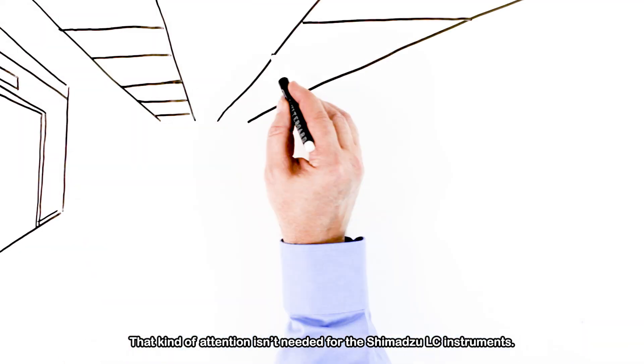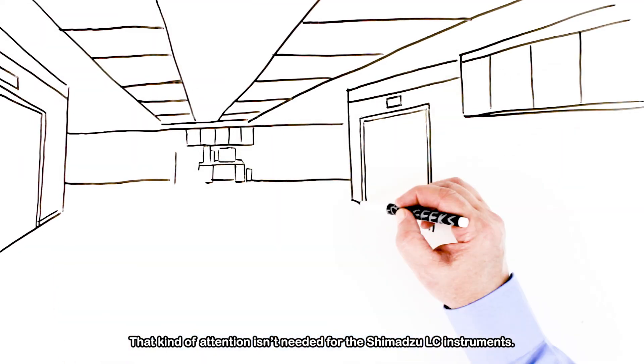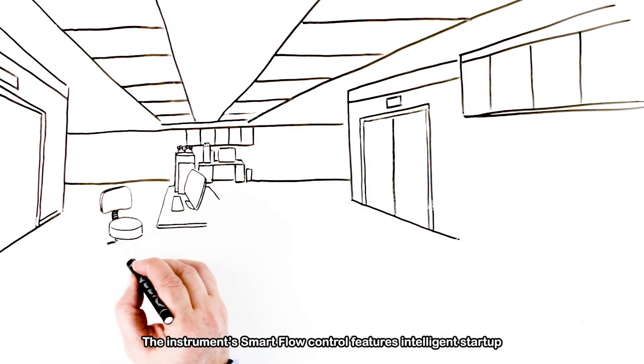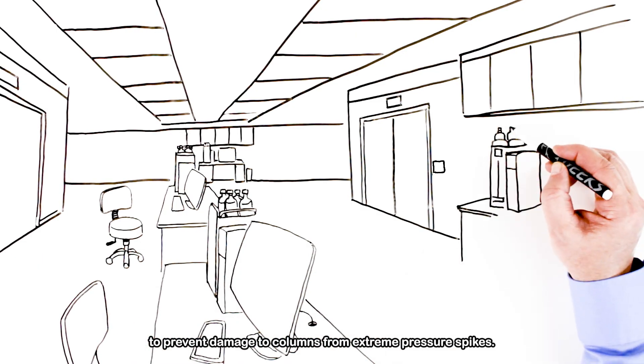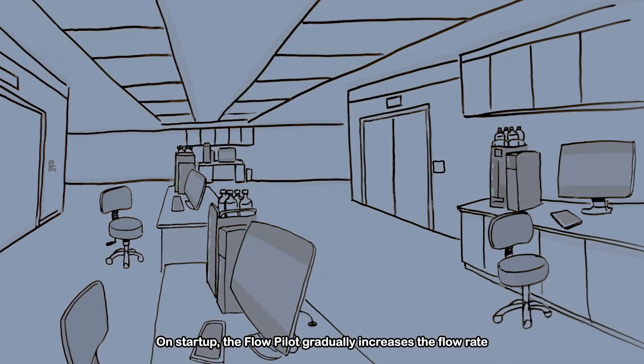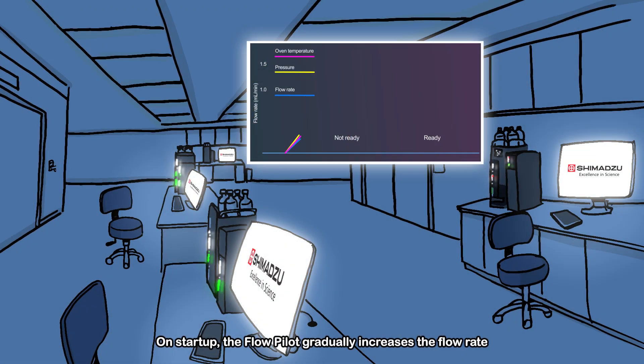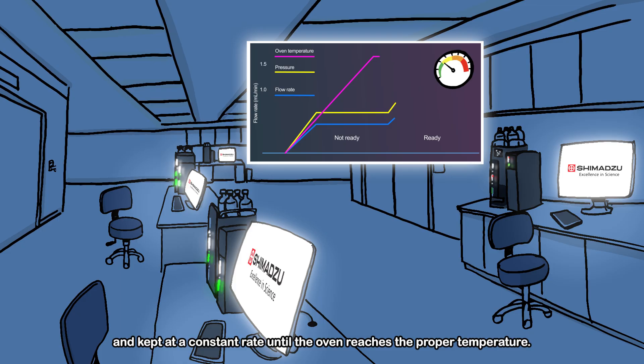That kind of attention isn't needed for the Shimadzu LC instruments. The instrument's smart flow control features intelligent startup to prevent damage to columns from extreme pressure spikes. On startup, the flow pilot gradually increases the flow rate to 50% of the predetermined value and keeps it at a constant rate until the oven reaches the proper temperature. Only then is the flow rate increased to the desired final value.